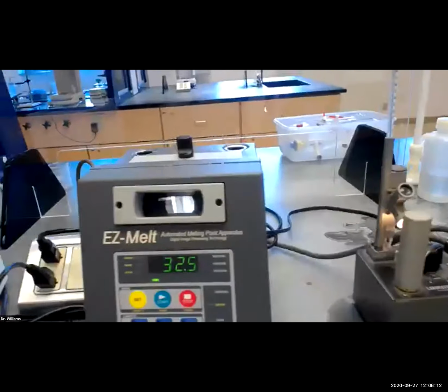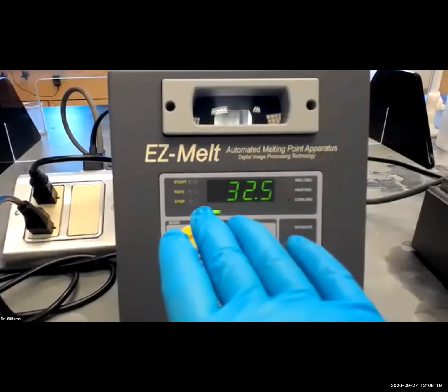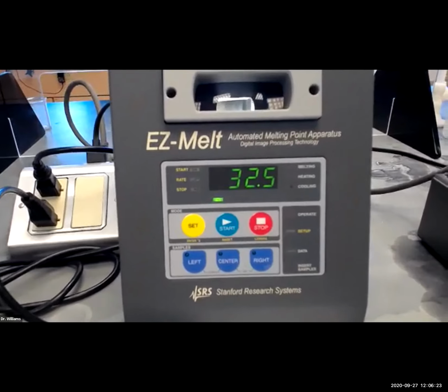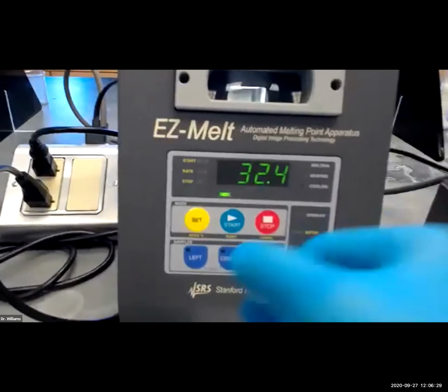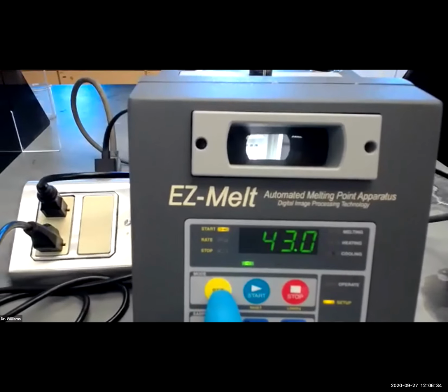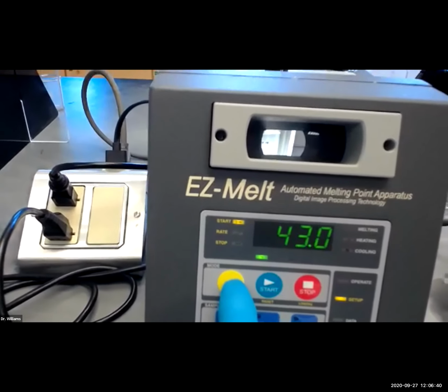So we go over to this one. This is the more modern. This is an Easy Melt, as I said before. So we're going to input the start temperature where we begin heating and the stop temperature. And I already gave you those numbers. I think it was 46 to 61. So if you press the set button, you see how it changes? Start, rate, stop. So you can just toggle through that.